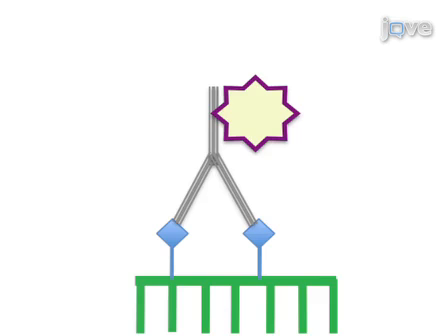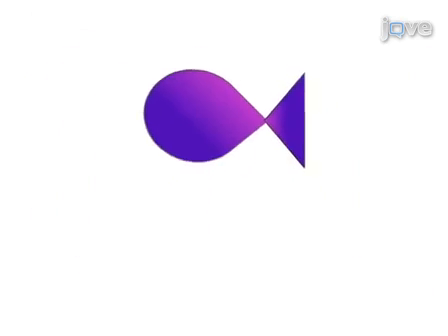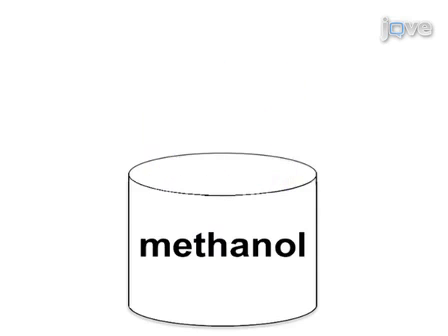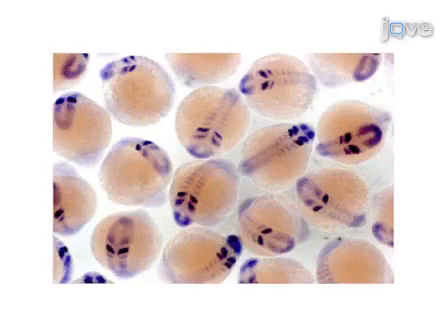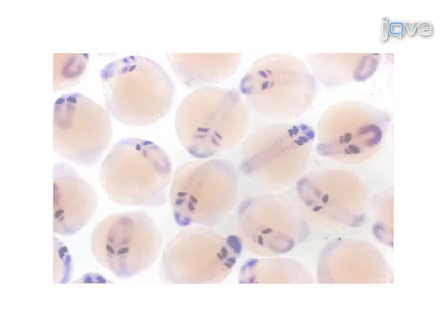The third step of the procedure is staining by the addition of NBT and BCIP, which react with the alkaline phosphatase enzyme to yield an insoluble purple precipitate. The final step of the procedure is to incubate sufficiently stained embryos in methanol to reduce non-specific staining. Ultimately, results that show gene expression patterns in whole zebrafish embryos at specific stages of development can be obtained using whole mount in situ hybridization.